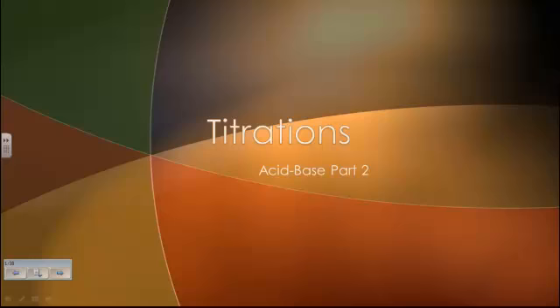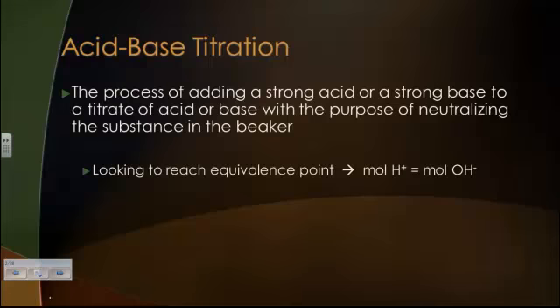Okay. This first part here is just going to be an introduction to titrations that you're hopefully watching first. It'll take just a couple minutes to go through a couple of details about them. A reminder that the word titration means that you are adding something stoichiometrically to something else.